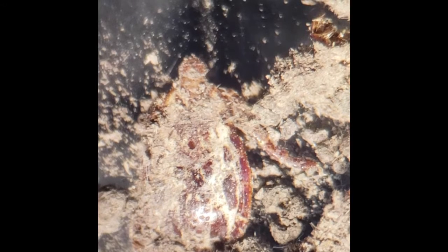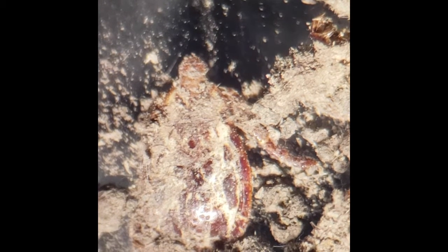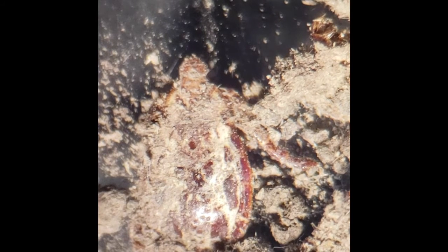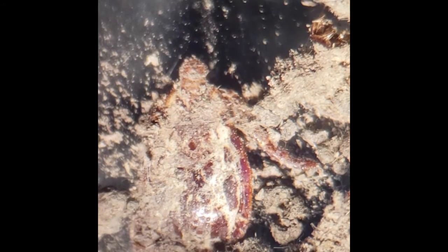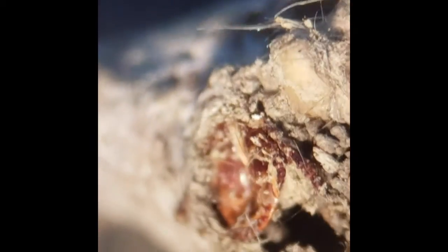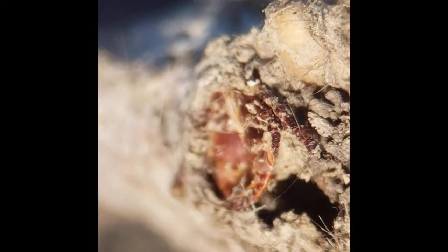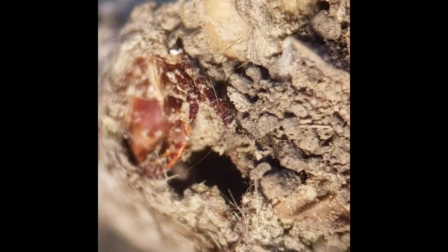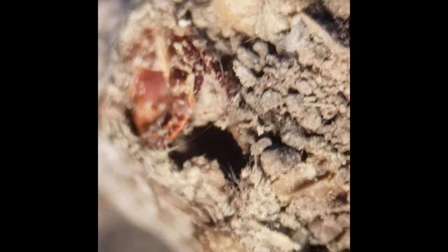Okay, the first notable find in this owl pellet is a tick. The second notable find is another tick, which brings up the question: were these two ticks on the same animal? Does this owl pellet contain the bones and hard parts of multiple animals?